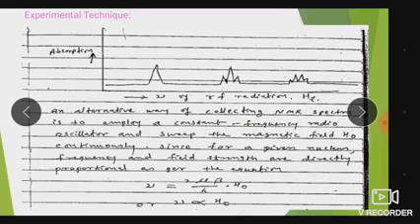Absorption versus frequency of RF radiation is taken.